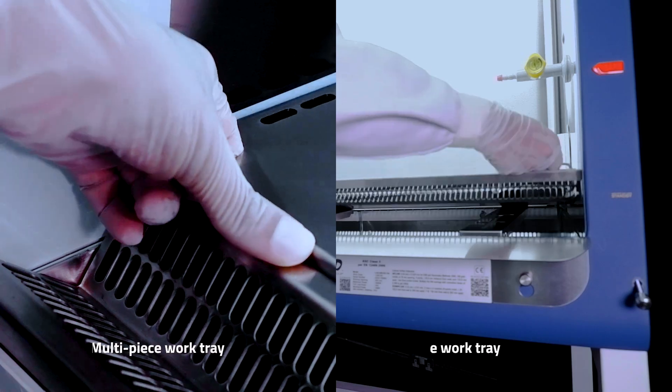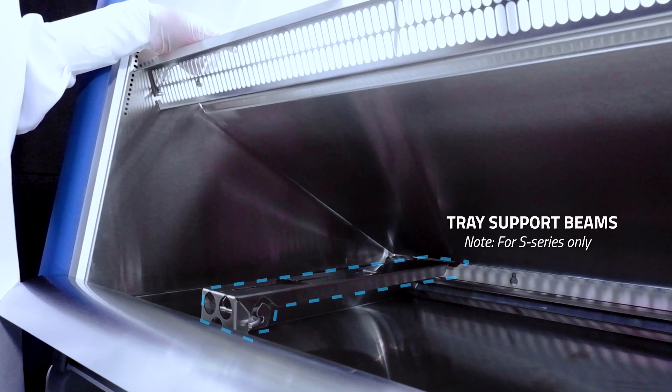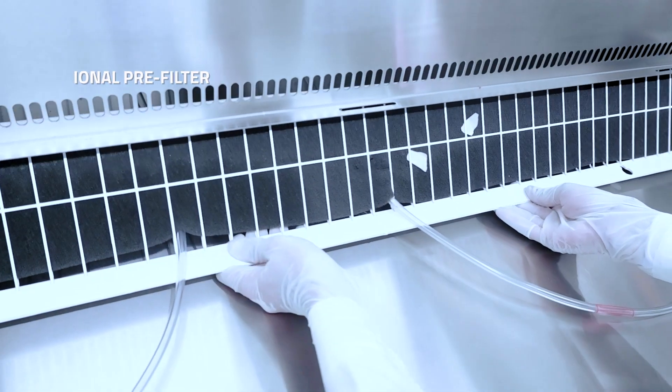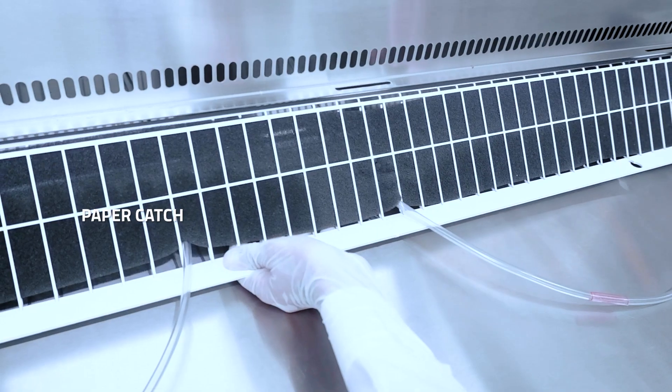Both equipped with additional features to facilitate effortless tray lifting. Support beams for reduced vibration, complemented by a holder for the work tray. The optional pre-filter, along with a detachable paper catch, safeguards against the entry of objects into the blower plenum.